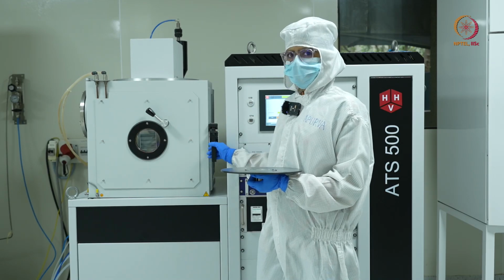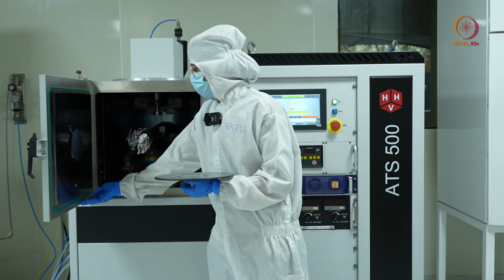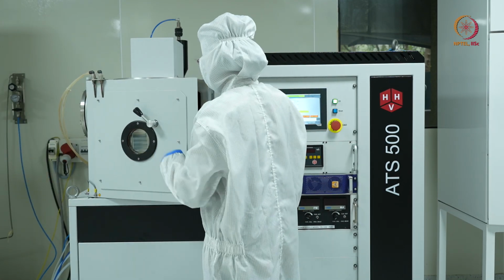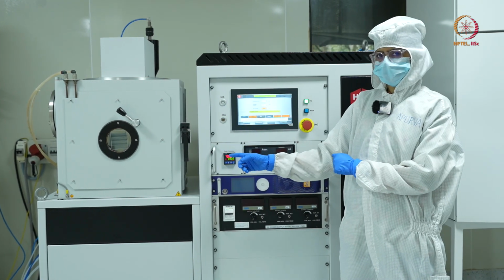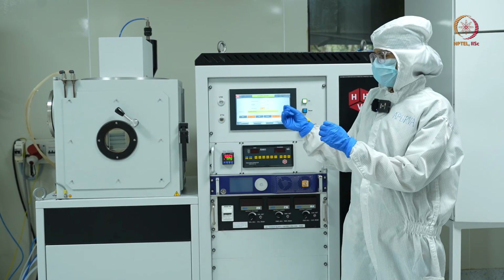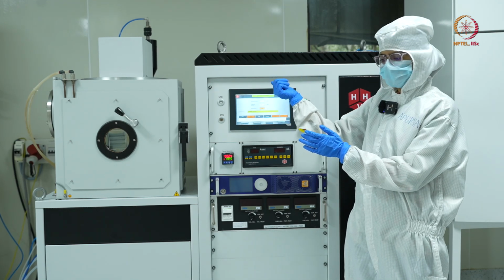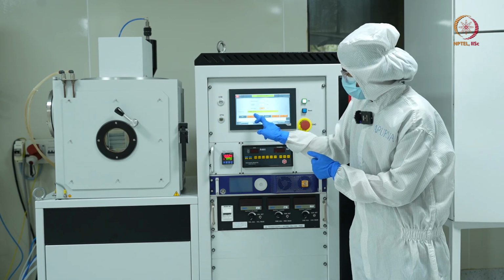The chamber is already in the vent condition. I'll open the chamber and place this substrate holder. Now the chamber is in atmospheric condition. I want a connection between my pumps, which are already running, and the chamber. To do that, I'll press cycle.